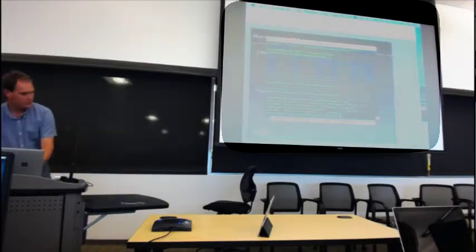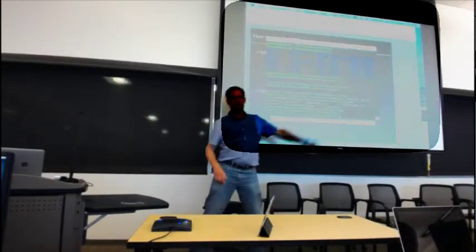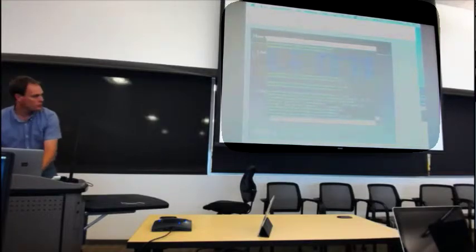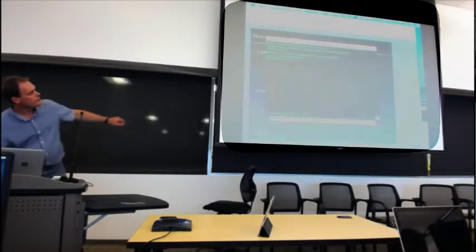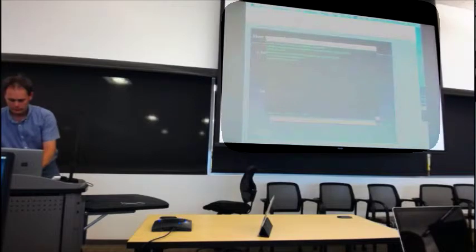Here I've got this Anton Cheetah thing, and if I look at GUI/crawler.config, you can see here I've got HDF5, the experiment number, Scratch, and then I just inserted my username there. So what do you do now?